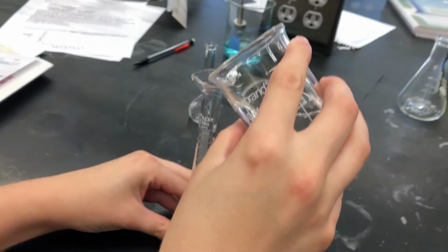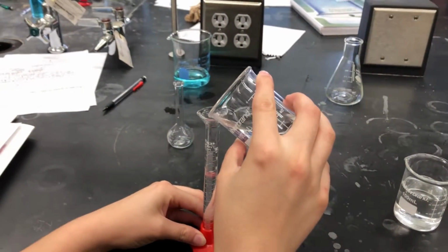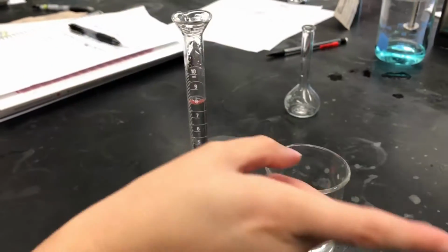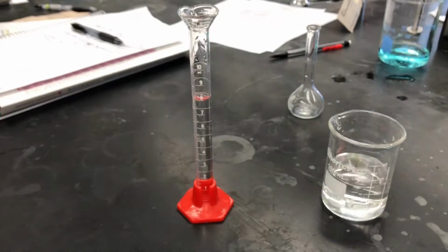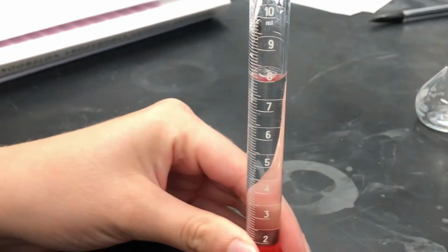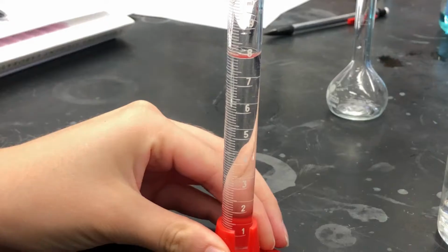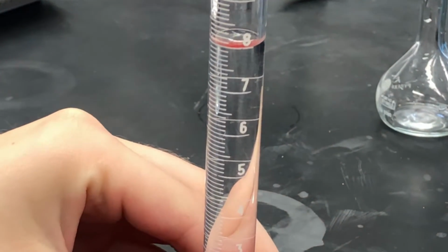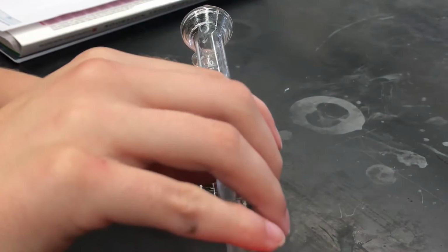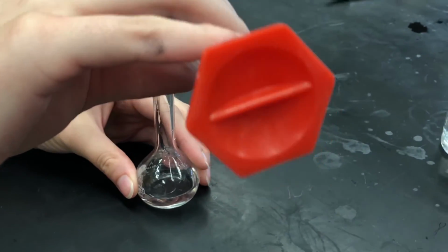For challenge 3, we measured the volume of the known 20% sugar stock solution. This was then transferred to the 25 milliliter volumetric flask, and the difference to 25 milliliters was diluted with the unknown stock solution.